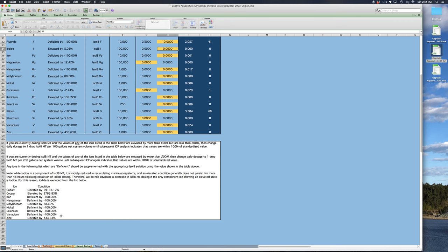And the reason I say that is that if MT is the sole source of some of these elements, like if you're not dosing selenium, and to you selenium is an ion that you want to maintain, then selenium is entering the system through MT. If you stop dosing MT, then no more selenium is entering the system through that route. An alternative route is simply to start dosing selenium through isolate SE if you're going to use our individual isolate solution. Again, this is all entirely up to whether you feel like the element in question is of importance in your system. That's a very contentious topic and not one that I'm going to address within the confines of this video.